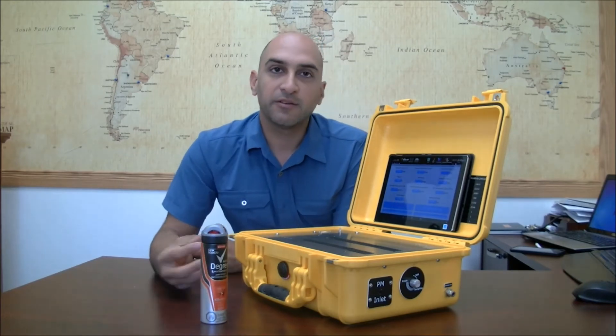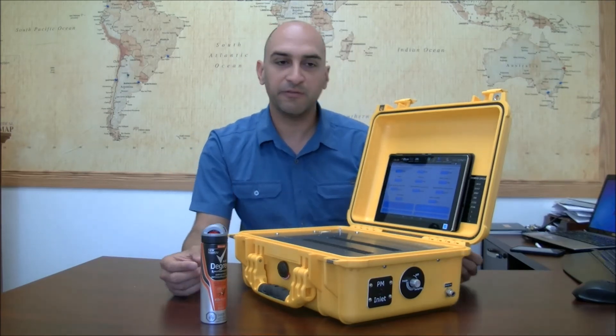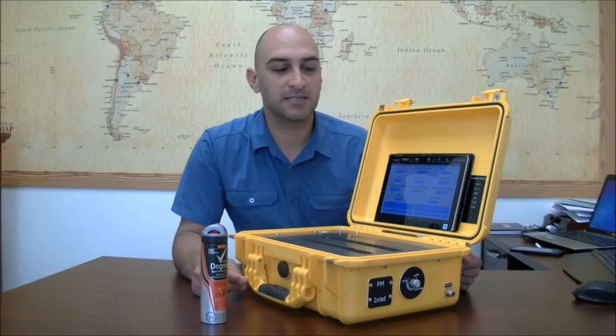The good thing with the PM sensor is that it's a laser-scattered PM sensor, so you will get all the different readings right away. And it's really accurate with very few drift issues as it gets older.